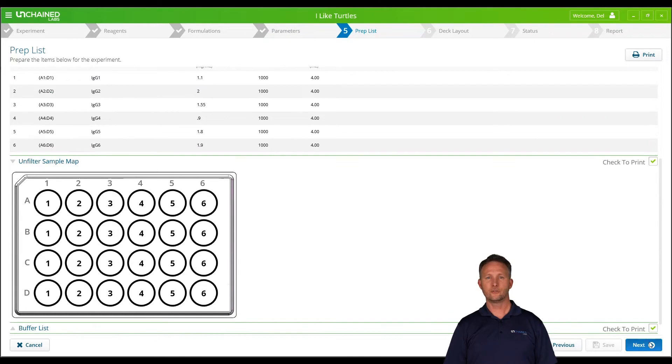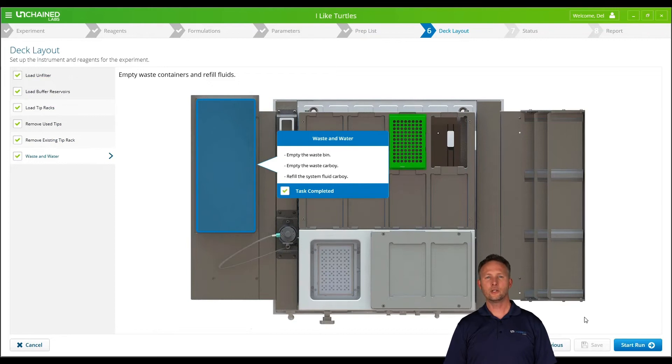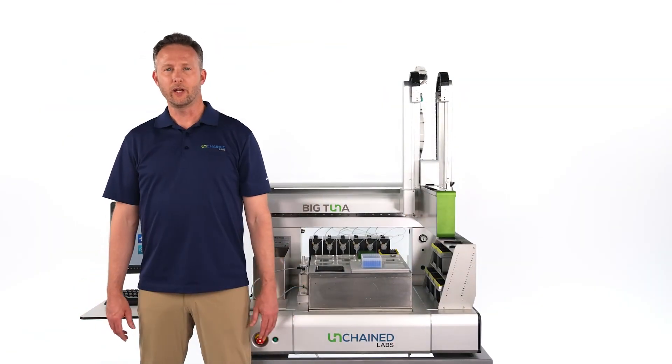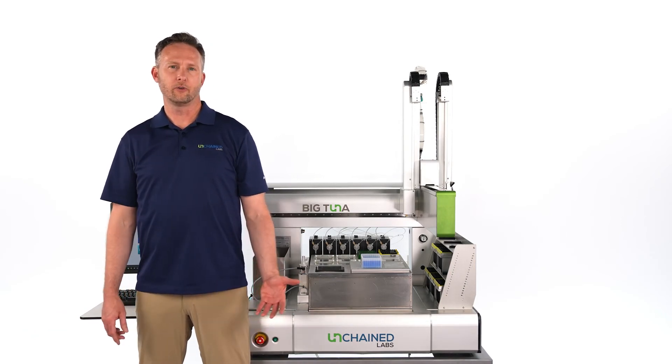Next, the software will guide you through where to load the samples, buffers, and tips onto Big Tuna. Now that Big Tuna is set up and ready to go, the last step is to pipette your samples into the Unfilter.